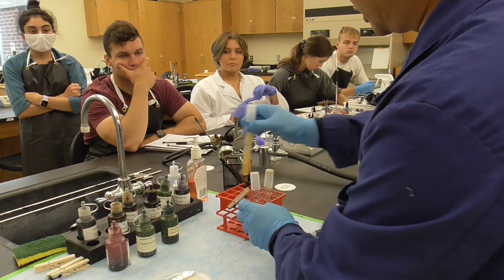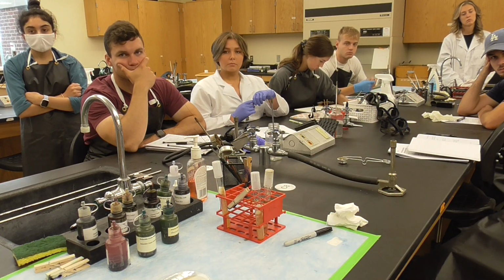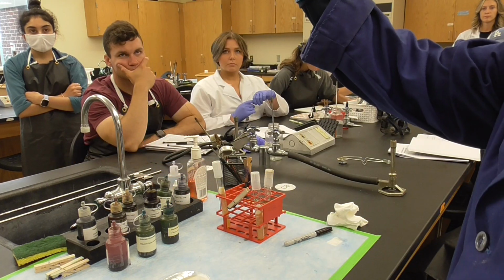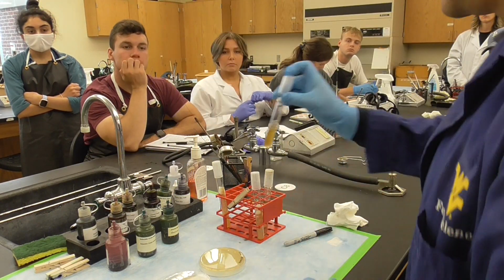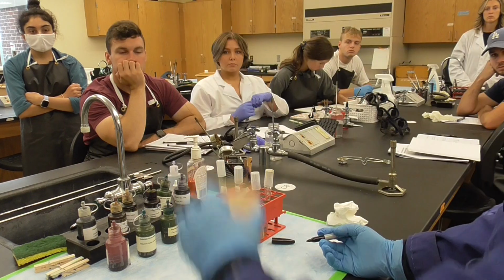Okay? So what we're going to do, we will use an E. coli agar. This E. coli agar will be for transferring bacteria. This will be your homework, which is for the mixed culture of Serratia and the E. coli. First thing first is label. So let's do the label of the agar first.